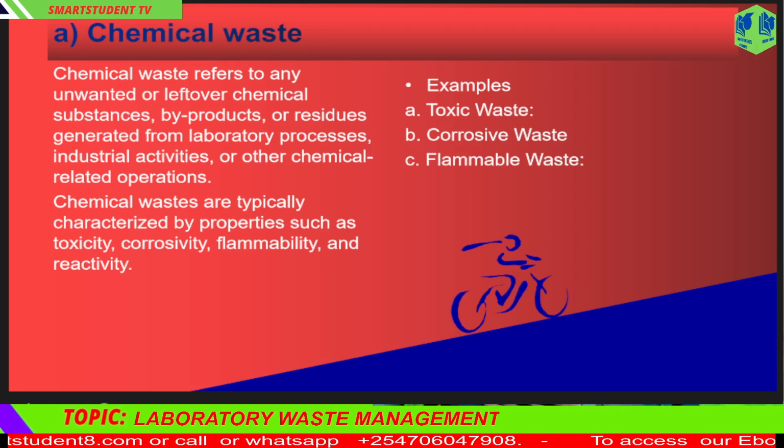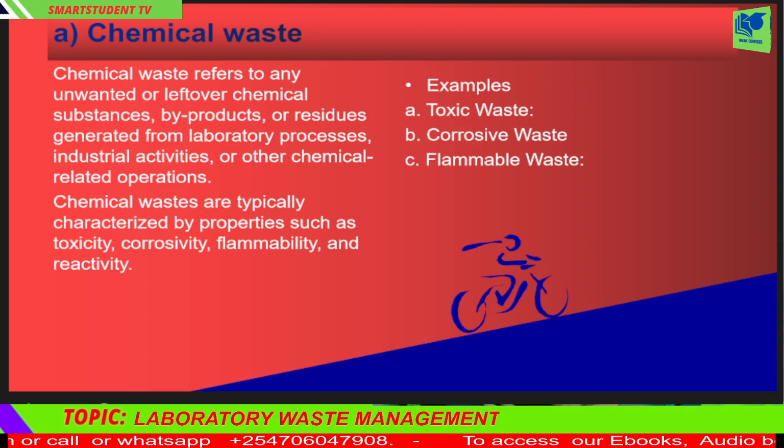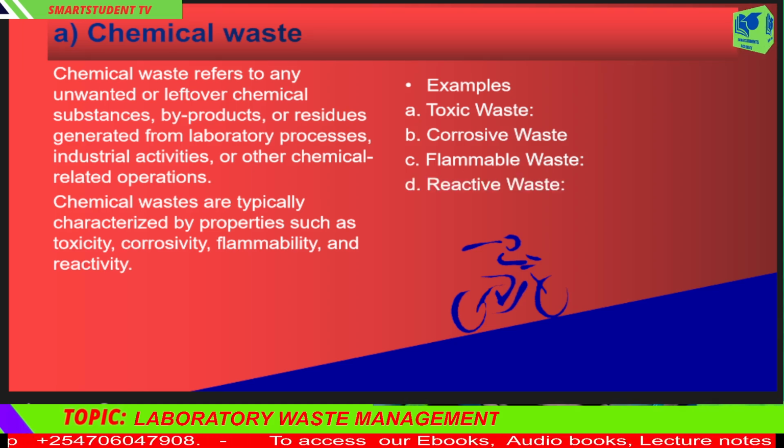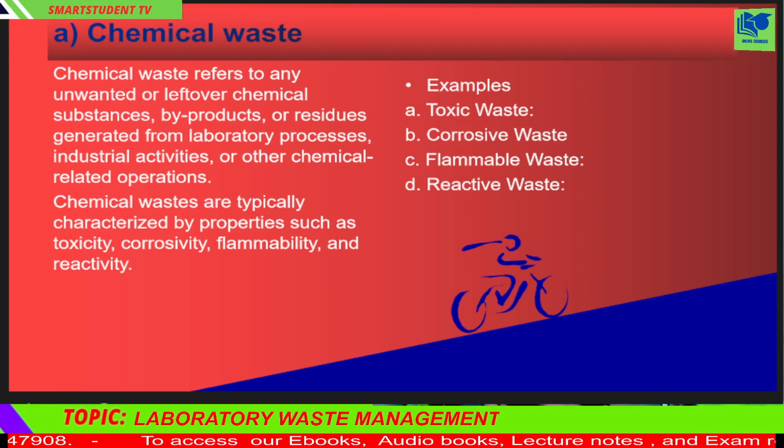C. Flammable waste. Chemicals that can easily catch fire. Example: ethanol, acetone, diethyl ether, etc. D. Reactive waste. Chemicals that can cause explosions, release toxic gases, or react violently with water or other chemicals. Example: sodium metal, potassium cyanide, etc.